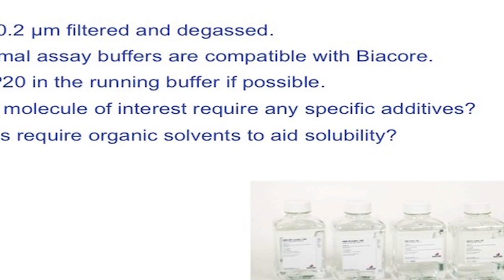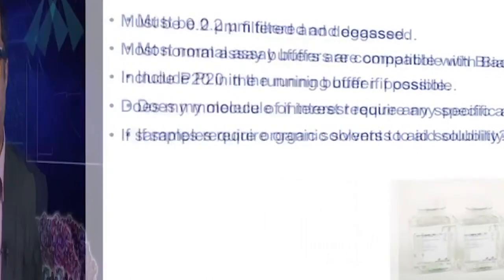Sometimes additives are especially required for your running buffer, such as metal ions or other activating molecules, activators. All these need to be added into your running buffer or sample buffer to maintain conditions for your experimentation. When we filter and degas, we also need to check for proper filters which are compatible with water and organic solvents.